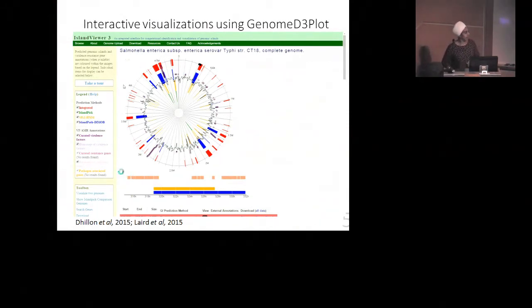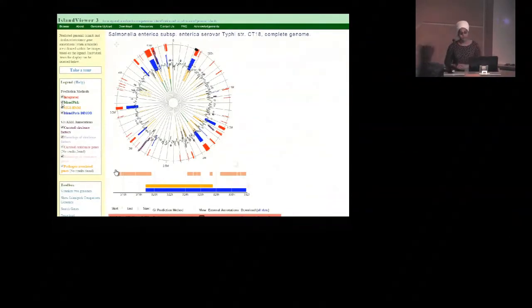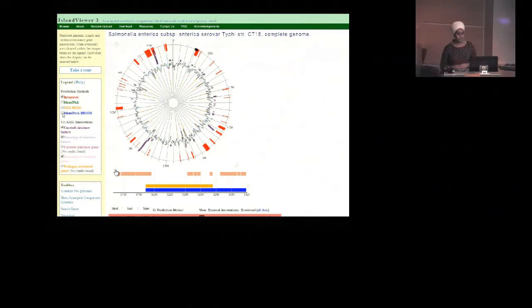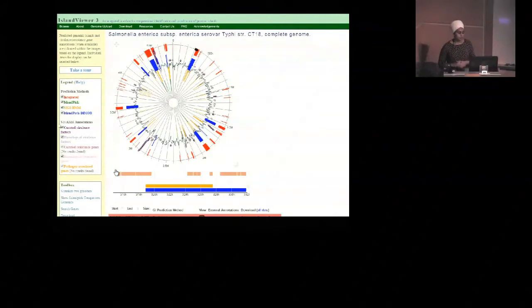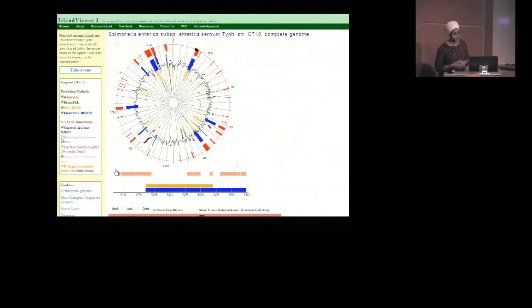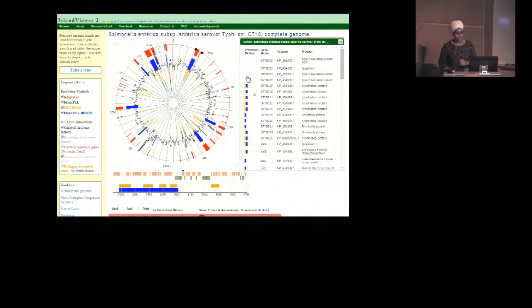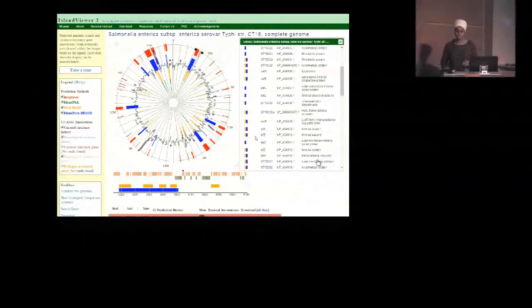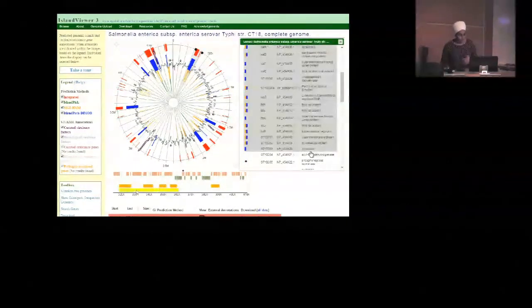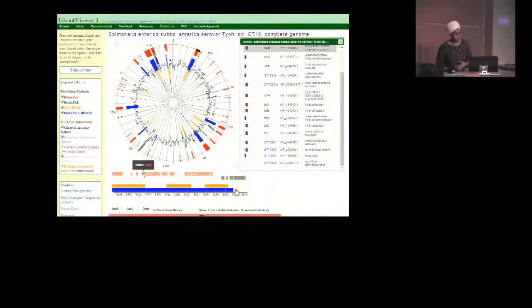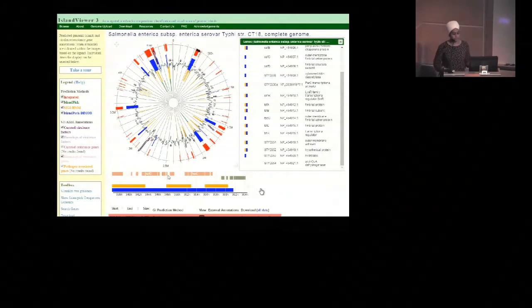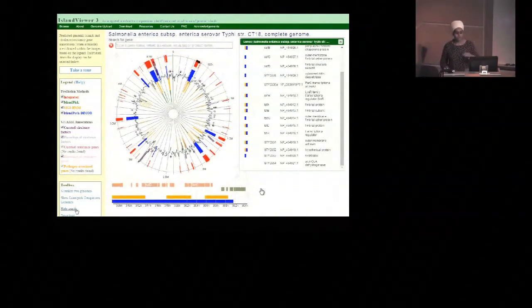I'll give you a quick demo. This is the main results page when you look up a genome in Island Viewer. On the left you can see the legend showing the different tracks, and you can turn them on and off dynamically — you can do the same for the annotations. If you only want to look at curated annotations, you can turn off the homolog tracks. It's really interactive — you can click on a region on the genome, and there's a horizontal view at the bottom synced with the circular plot. A vertical view pops up showing the details of the genes in that region. All the views are synced, so you can really explore your genome. You can even search for your favorite gene of interest and it'll show up in all three views.